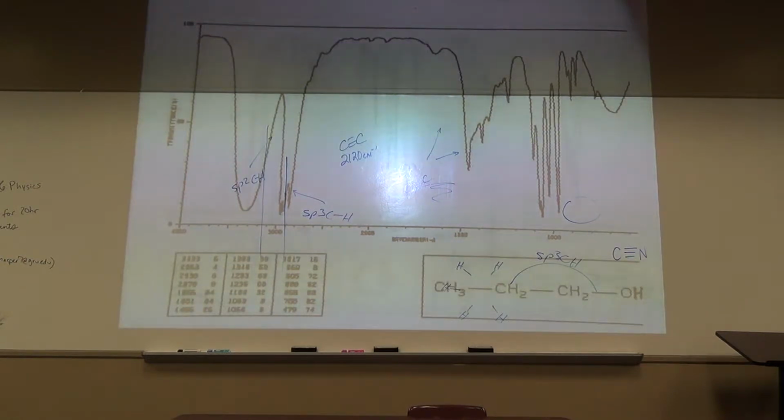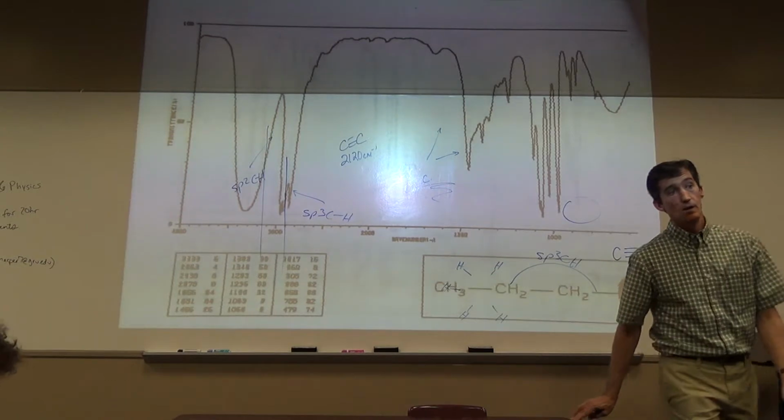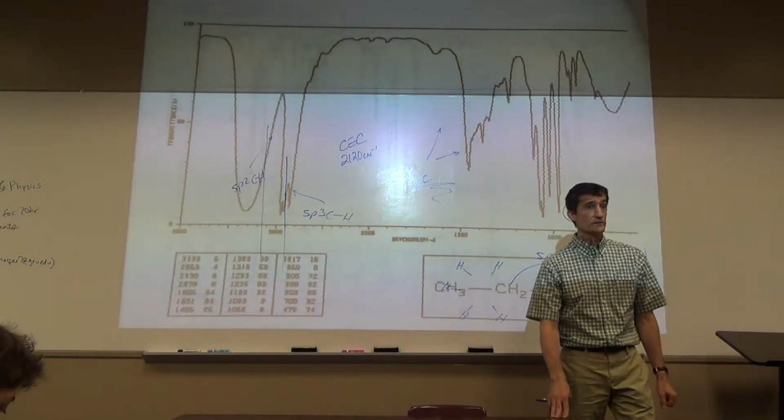The C-Cl? Where would you expect that to absorb? C-Cl should be, but it's a single bond, so it'd be in the fingerprint region. C-Cl's fingerprint. All single bonds are fingerprint unless it has an H.